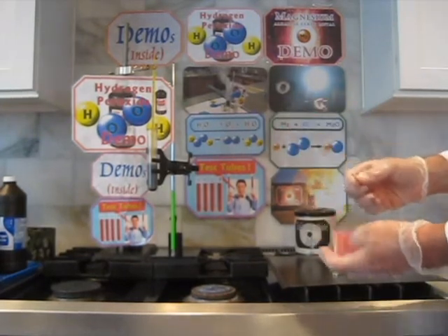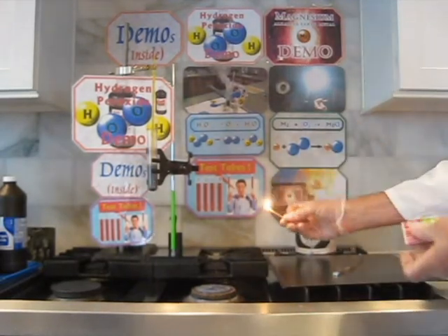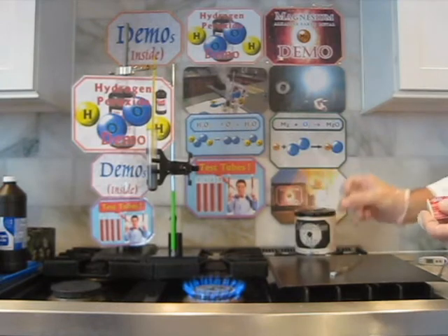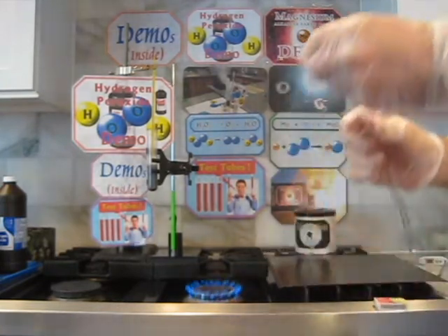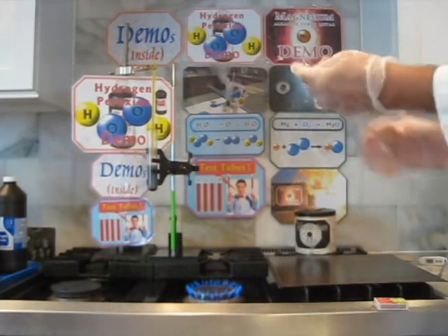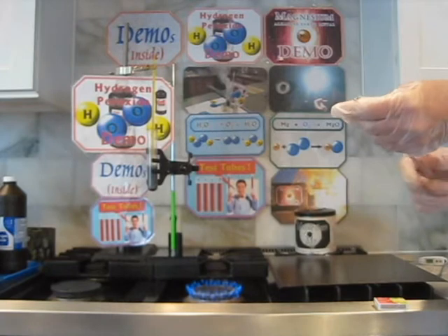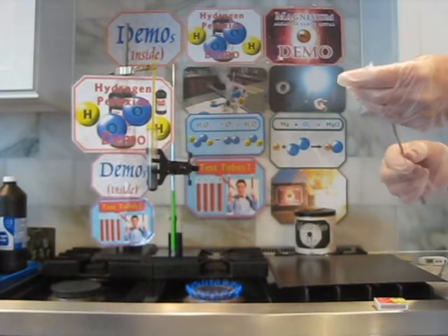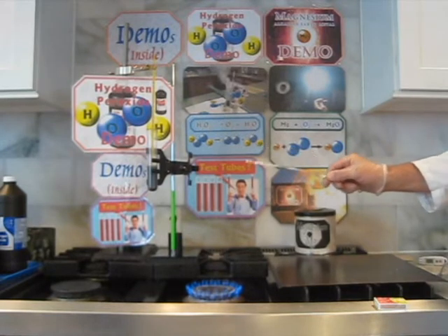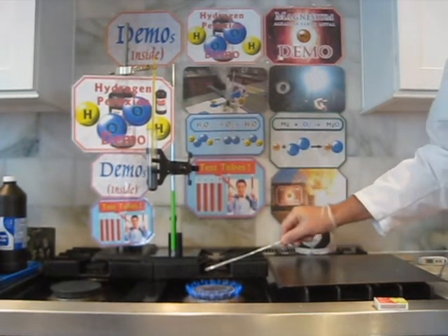So first of all, let me turn this on a little, and then I'm going to light the match. That's one reaction. Second reaction. Okay, put the match out. Now I'm going to use that to light the magnesium ribbon. Now this is a very bright reaction, so just make sure to avert, those of you that are in the room, my kids, just don't stare at it for too long. Try to avert your vision. Okay, you want to see it, but you want to also not blind yourself.